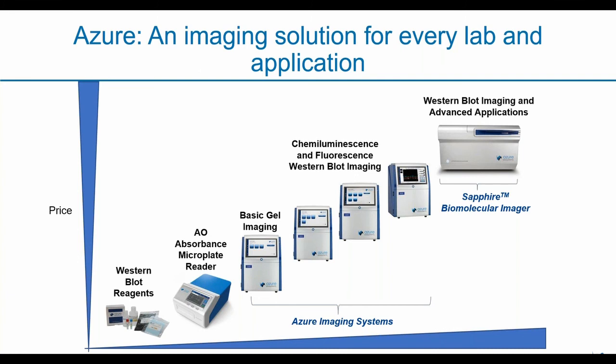Total protein image signals are normally fluorescent signals, so you do need digital software to analyze it. Let's say you do not want to use brand-specific software, you can use ImageJ.